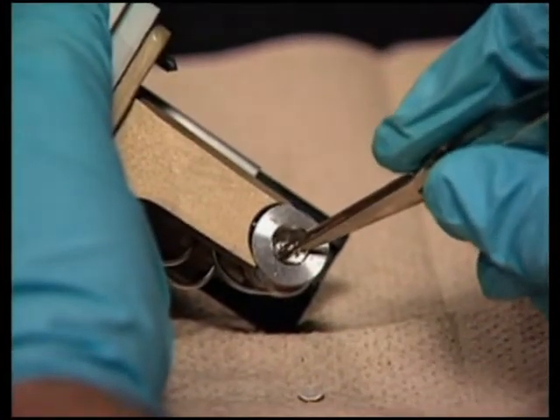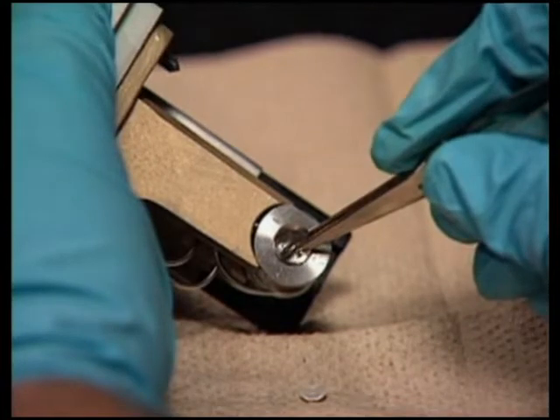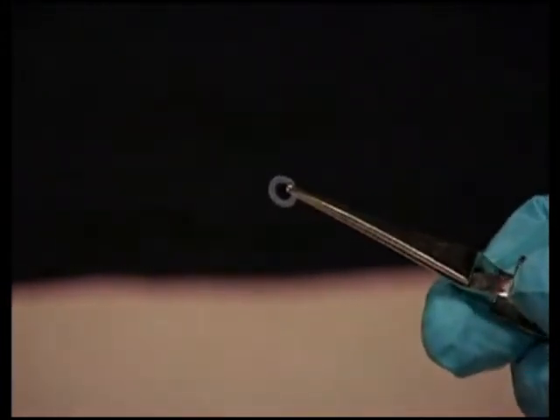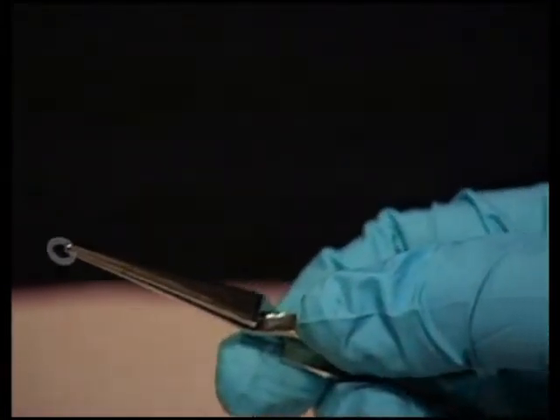Next, use the tweezers to remove the clear plastic gasket. Using the tweezers, remove the new gasket from the flow cell gasket rebuild kit and inspect it for cleanliness. Drop the new gasket into the groove at the bottom of the flow cell body.